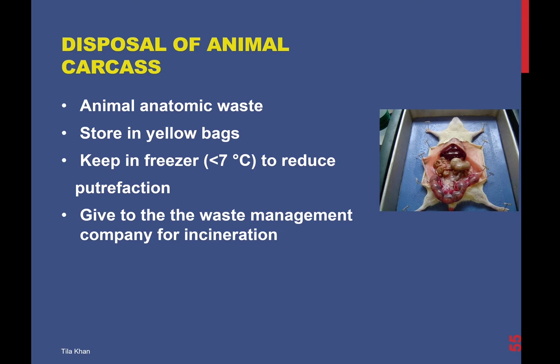And then we set up a time with the waste management company, and whenever they come to IIT, you just hand over this bag to them, and then they will take it to the disposal facility for incineration. So please do not autoclave the animal carcass.